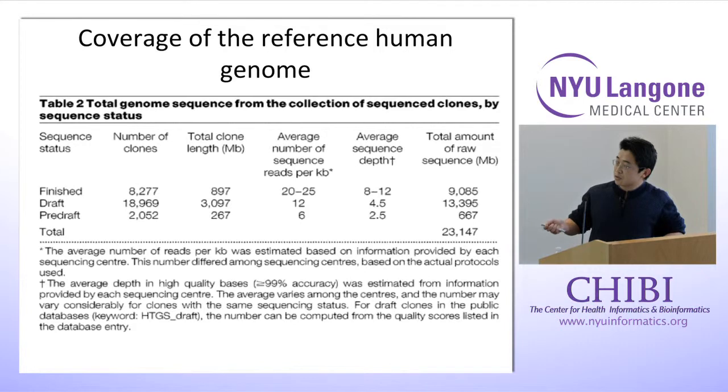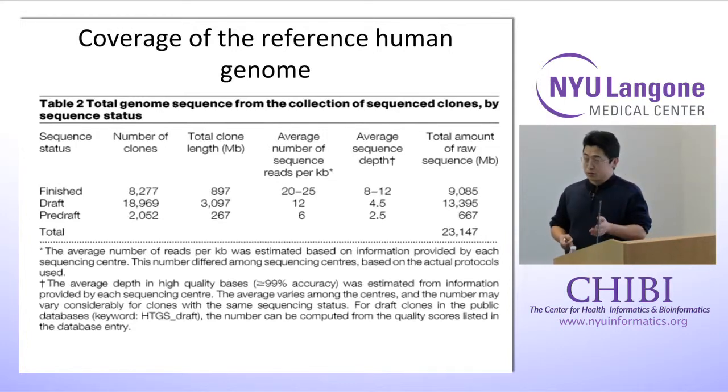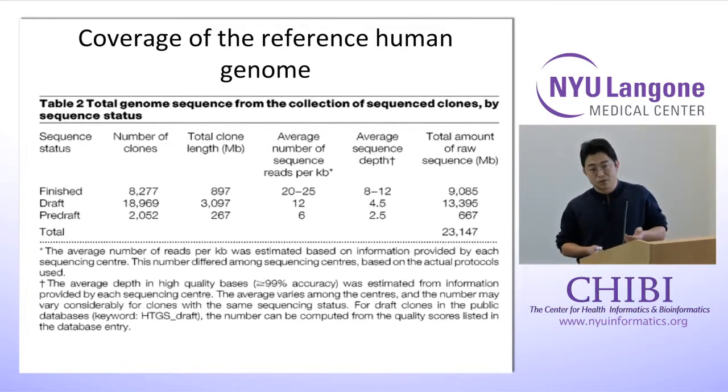The coverage of the draft genome was 4.5x, and the finished genome is about 8 to 12x coverage. We see continuous updating of genome versions, from HG16, 17, 18, 19.